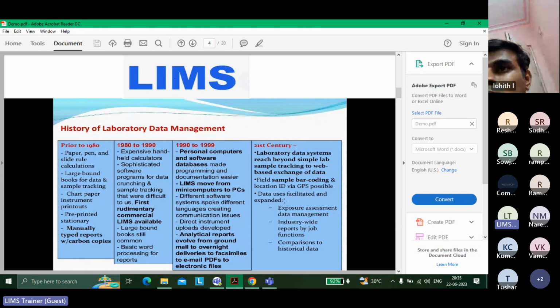In very simple terms, a laboratory information management system is a tool. It is used to log samples, enter results for those samples, and report the results of those samples. Of course, these are very simplified descriptions. It's much like saying that the job of a lab is to perform tests. When we say LIMS, we can say we can work on inventory, we can create reports, we can work on lots of things.